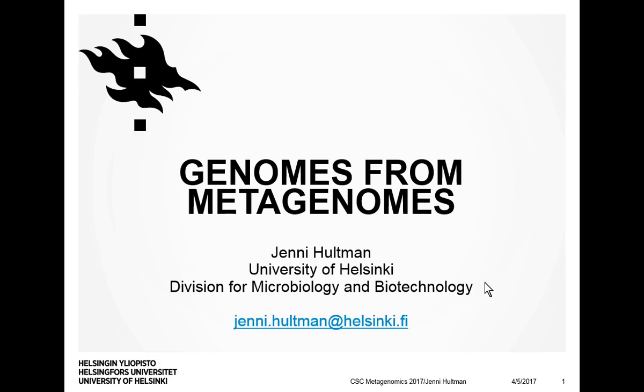So I'm going to first talk about how to get genomes from metagenomes, because I saw that that was not covered in the program of this workshop. And then I'm going to tell you something of my own results on working with the Arctic metagenomes.